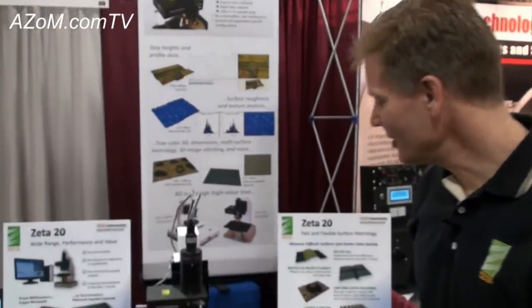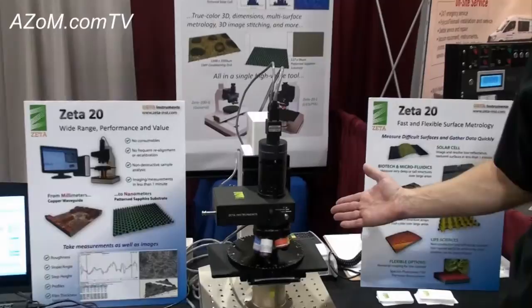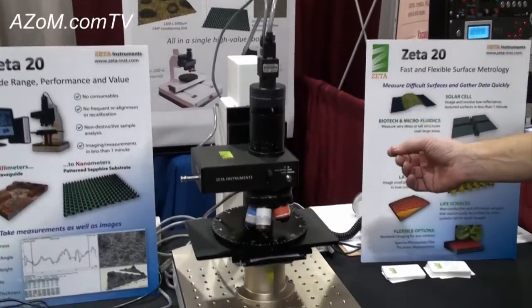Great, thanks Cameron. This is our Zeta instrument. This is one of several series that we have. It's an optical profiler.